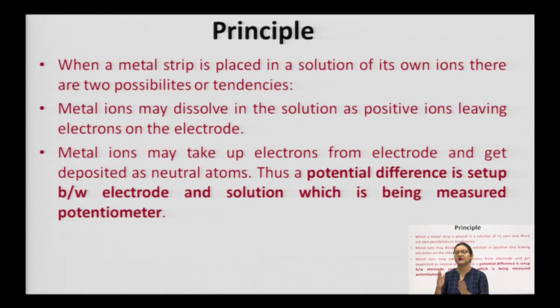The reference electrode has the purpose only for reference. Referring to it, our indicator electrode changes its potential, which we have to measure. Once the E cell is measured, we can easily calculate our analytical concentration, or the concentration of the analyte in our test solution, the solution to be determined.